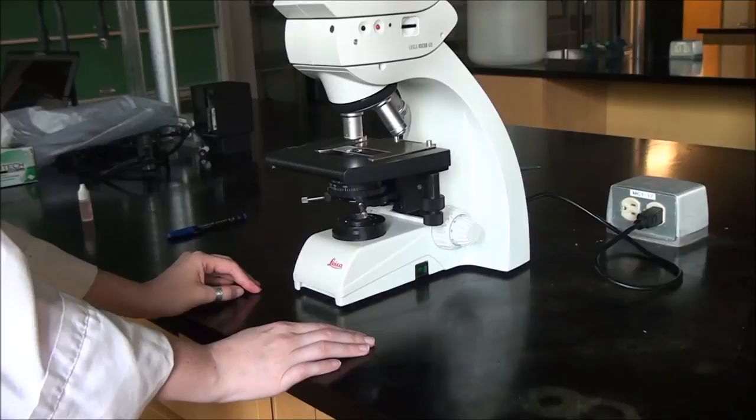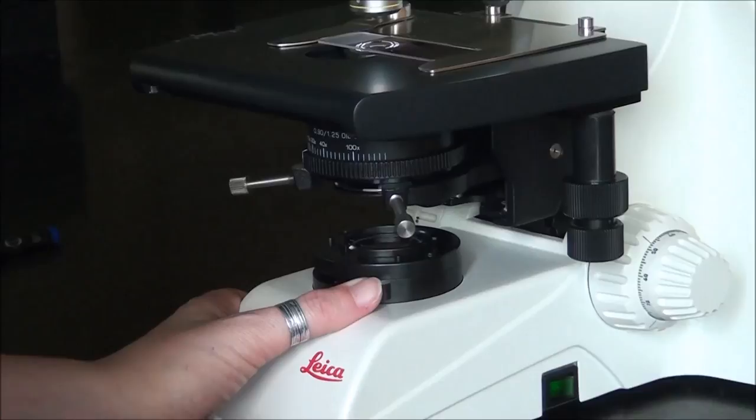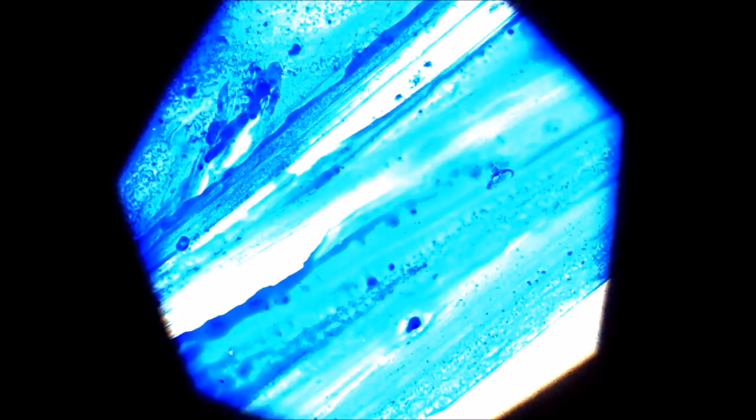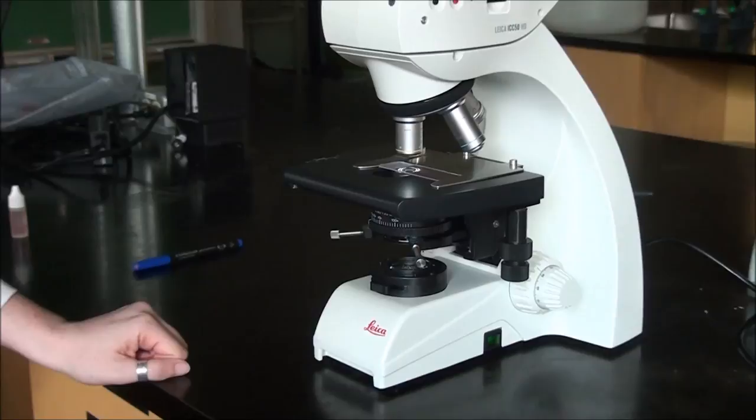I'm going to move to the field diaphragm because everything is aligned. Now it is a matter of getting enough light for contrast and resolution balance. To adjust the field diaphragm, we're going to look through our ocular lenses and open the field diaphragm so that the entire field of view is lit up.